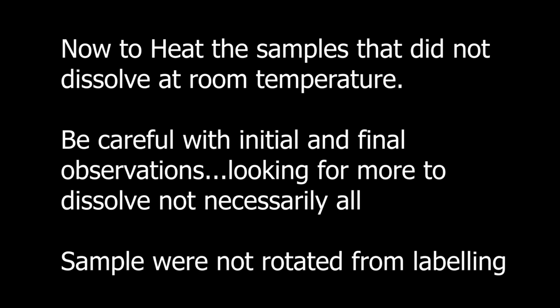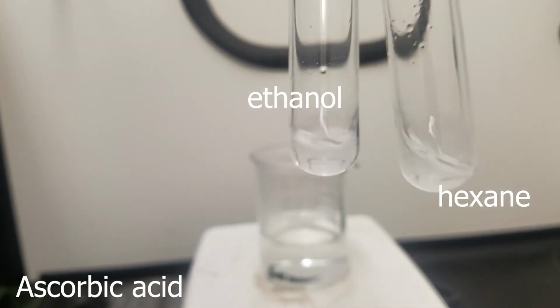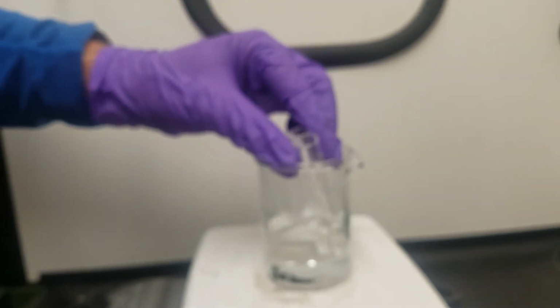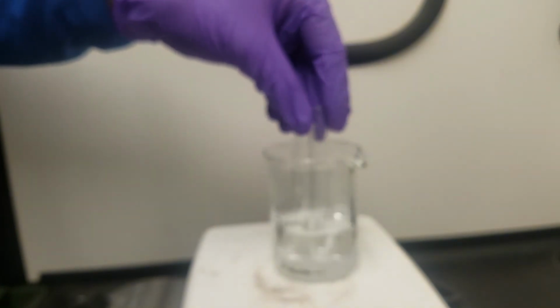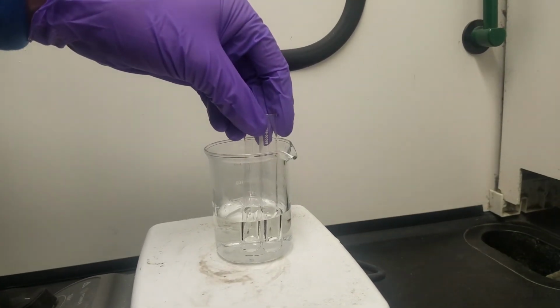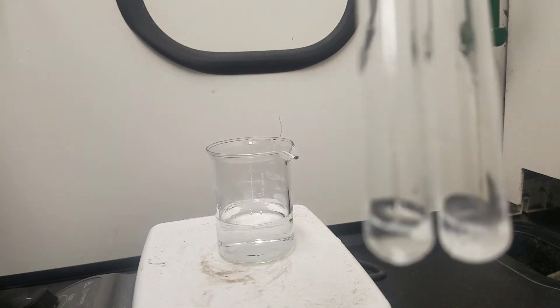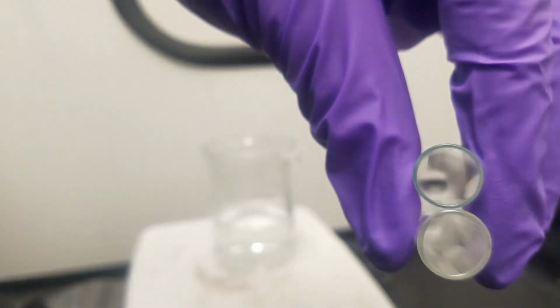Now what we'll do is go through and heat each of those samples if they did not dissolve. We want to see if heat's going to help improve solubility. So all we end up doing is taking those test tubes. I'm trying to be very careful with the orientation and not switch it up so that the test tubes align the same. And we want to see if we get any observation changes. Time is definitely sped up on these to help with that visualization or to shorten the amount of time that we spend in this. So again, little slight mix-ups, and you can kind of see if there's any white powder remaining after we do it.